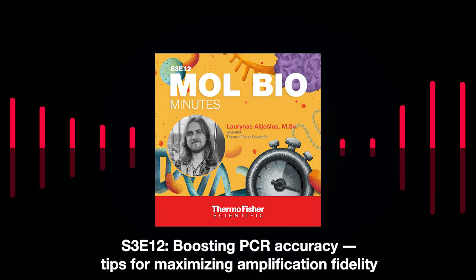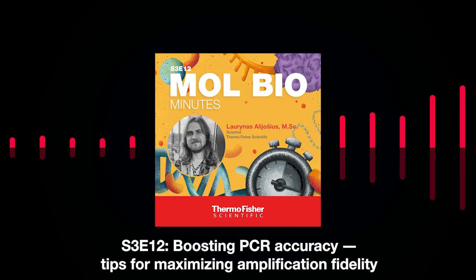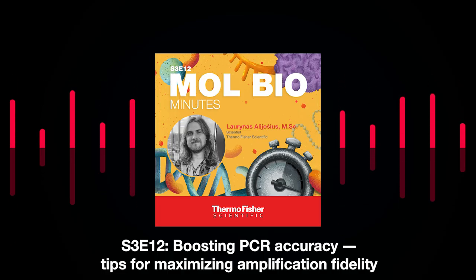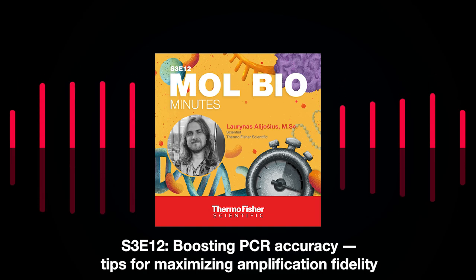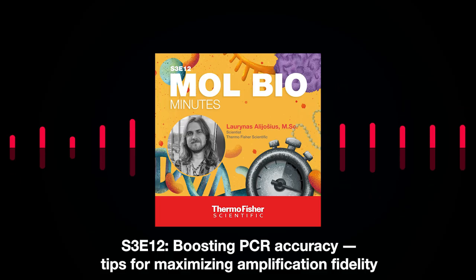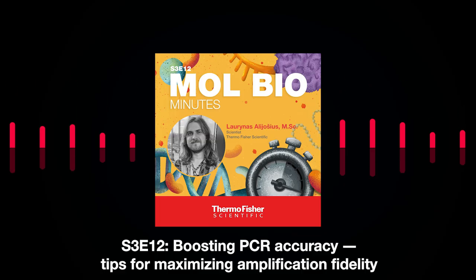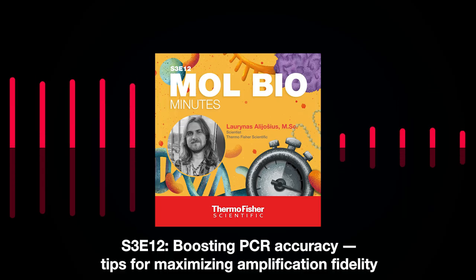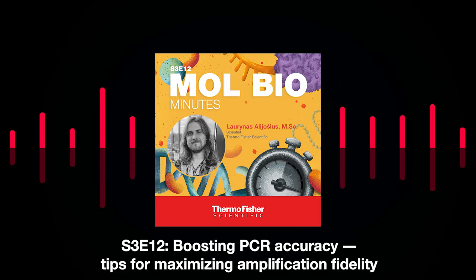And for that, you can use our resources pages, or you can follow the manuals of polymerases or the PCR kits. Also, for a DNA template, you could use a purified DNA template when possible. Otherwise, if you need to use things like crude samples for a template, or you have to deal with impurities in your DNA template, then you could consider using a DNA polymerase that is resistant to inhibitors. So that could help you in this case a lot.